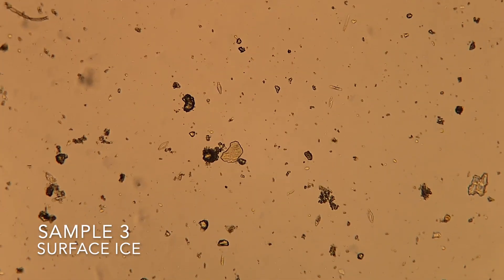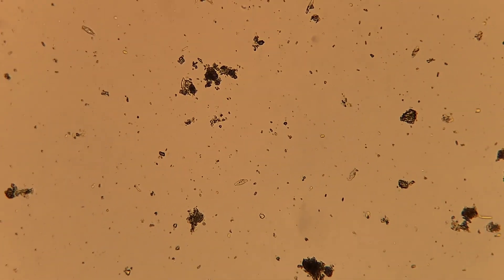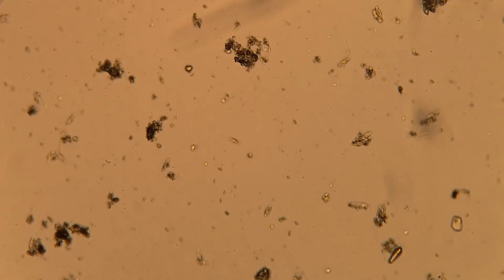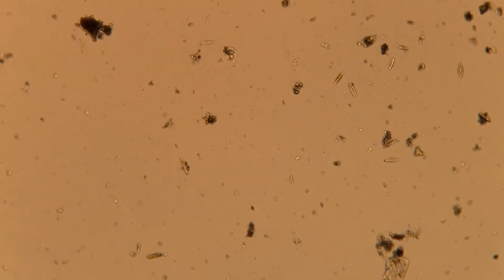There was just a lot of debris. You can kind of see there's a little bit of single-celled algae, but mostly it's just junk. Oh, there's a little guy — hi, little buddy. But yeah, for the most part there was not a lot living on the surface.